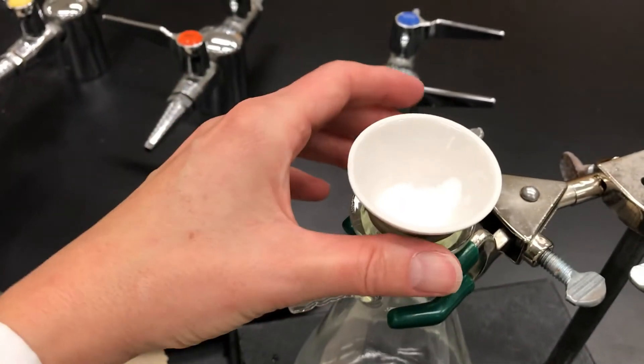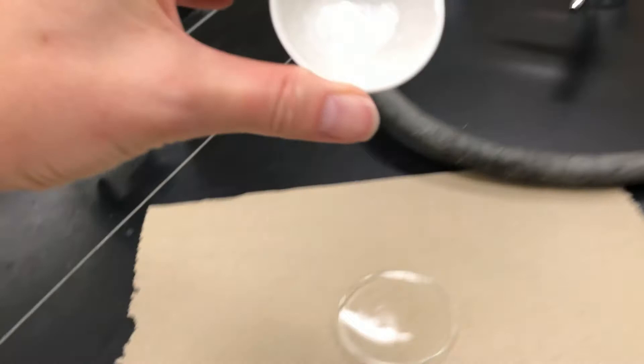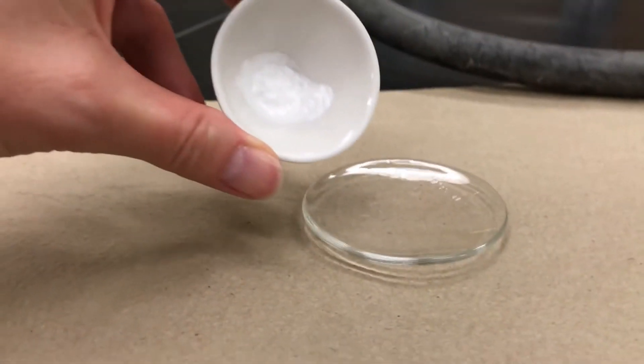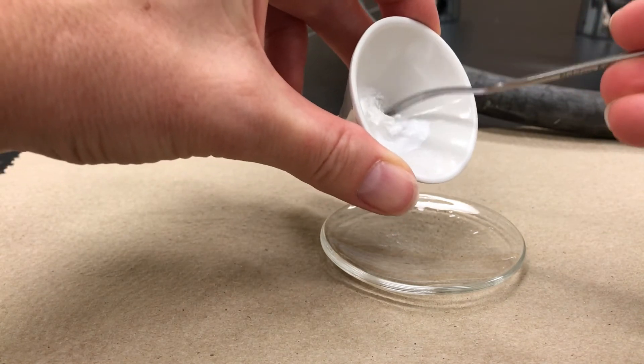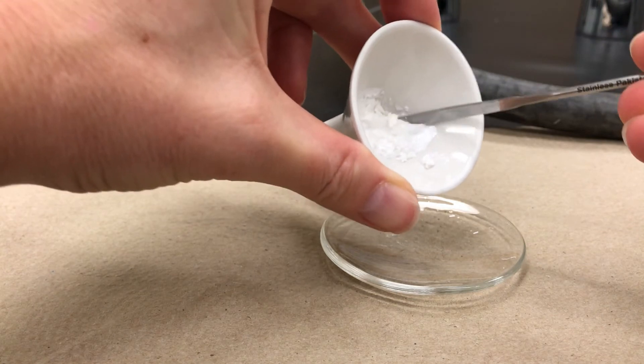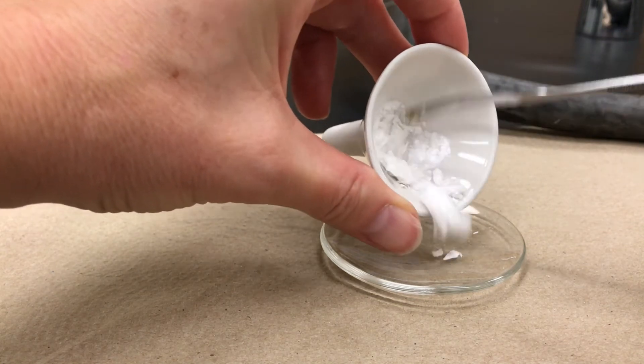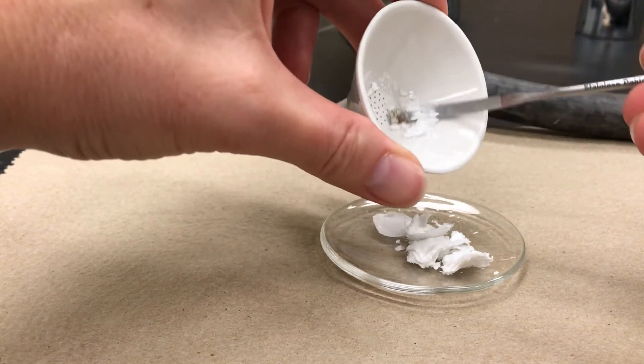And then you want to take your solid and dispense it onto a pre-weighed watch glass. You can use a spatula to transfer the solid onto the watch glass, and it's a good idea to even transfer the filter paper as well. Take the whole thing onto the watch glass.